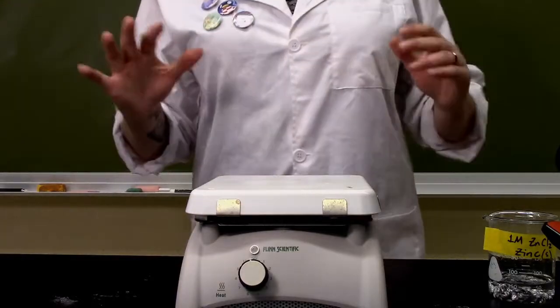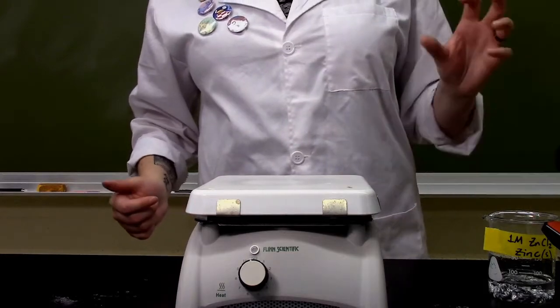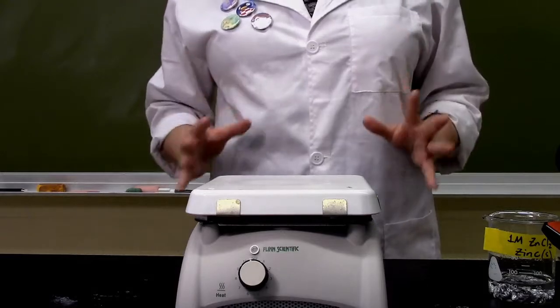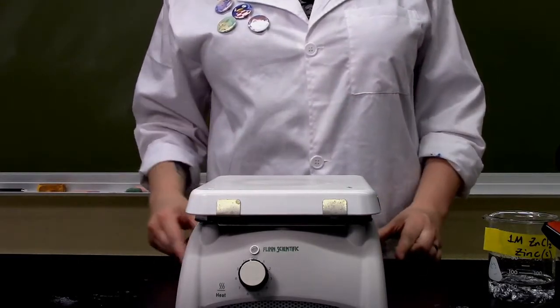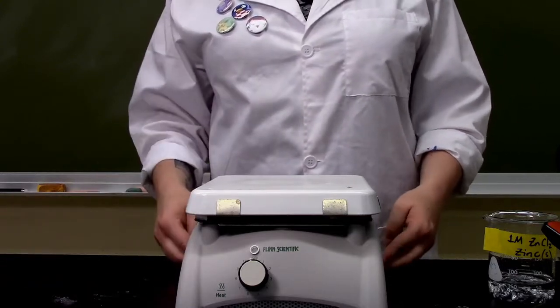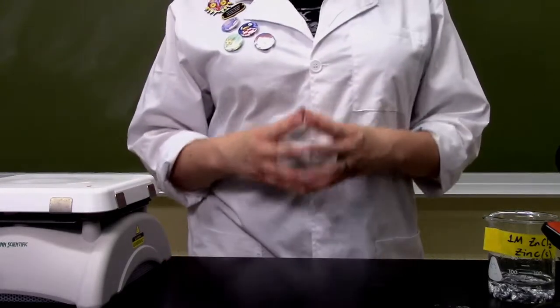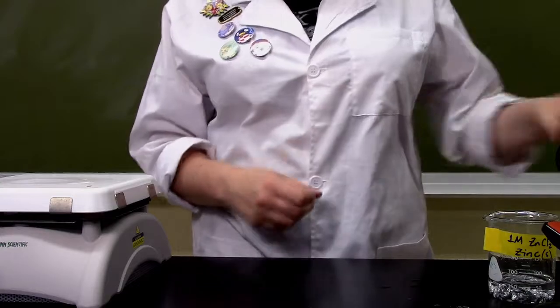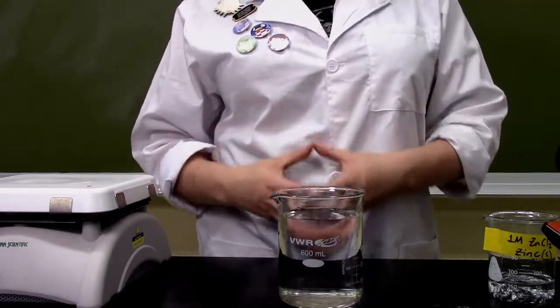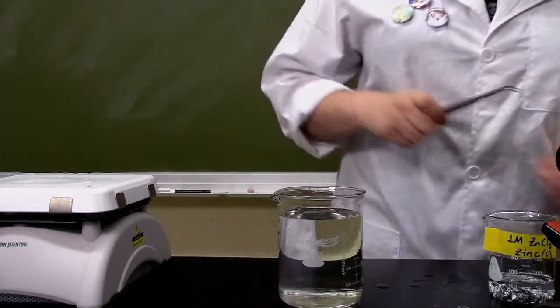At this point, I have a very hot plate and a very hot solution of zinc chloride, zinc metal, and pennies. I'm going to carefully move my hot plate using the base, which is not that hot, not hot at all. I'm going to scooch it over to the side a little. There we go. Next up, I'm going to cool my pennies down by dipping them into a beaker full of cool water. This is just tap water, and it's gonna make a very loud noise, just to warn y'all.